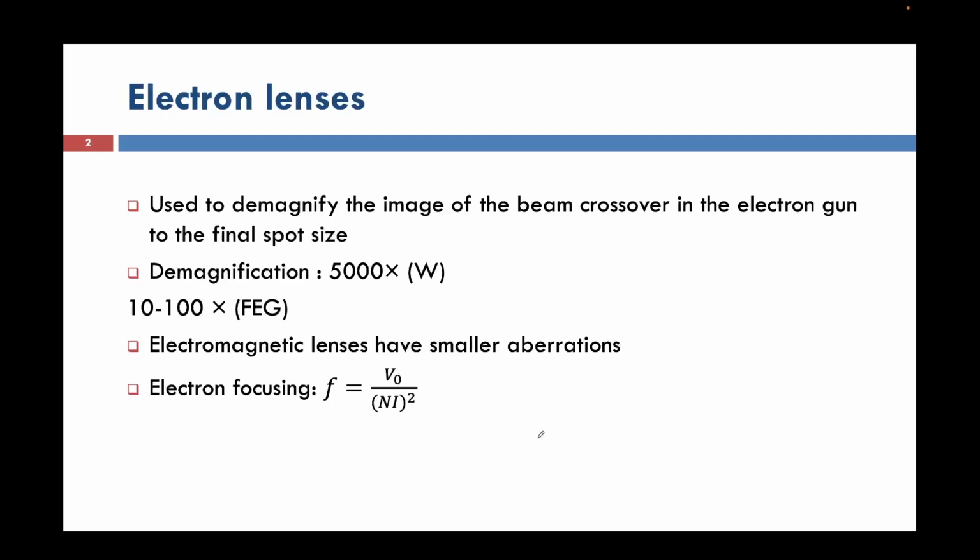First they spiral around the optic axis, and why they spiral, all those things we have discussed. We also discussed how the brightness and work function of a material are critical factors determining the electron gun size.